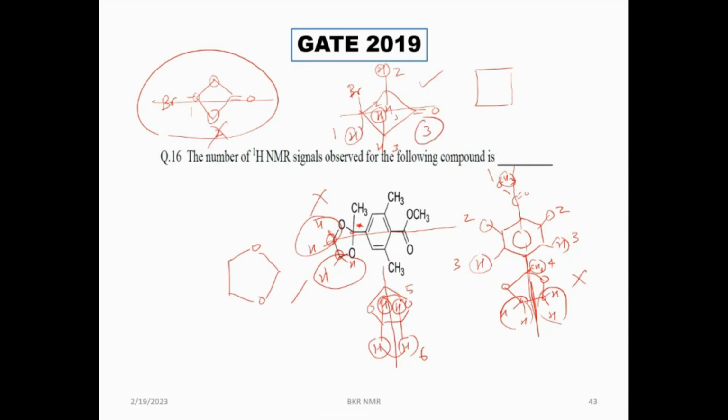So this is the field effect, ma'am. Yes, we have to look at it using the field effect. So you are talking with respect to the plane of symmetry. The field effect indicates that they are different, because the proximity of the hydrogens to the neighboring group is different. So these hydrogens are closer in space to bromine, whereas the bottom hydrogens are closer in space to hydrogen. Absolutely. So they are different hydrogens.